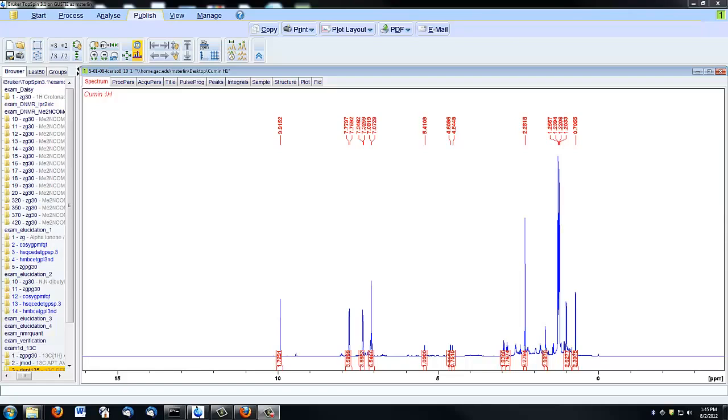This video will walk you through the process of plotting and printing your completed spectrum. Once you're ready to print, click on the Publish tab.